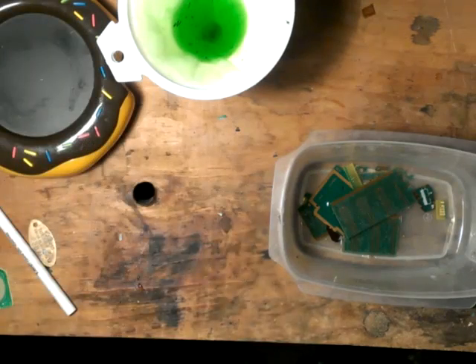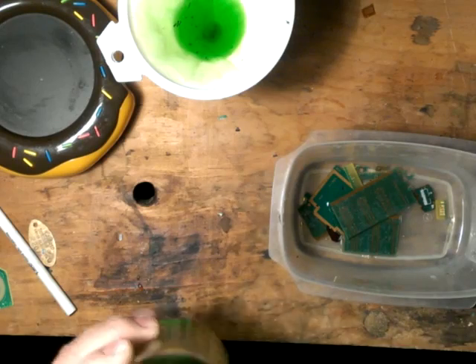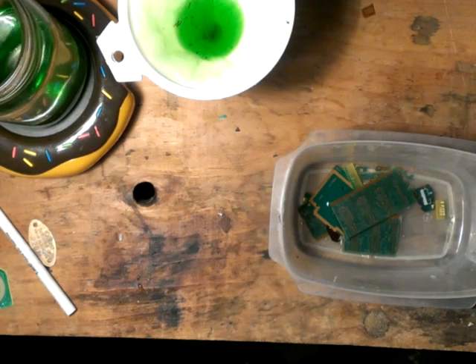Do not discard any of your chemicals. All that green stuff is copper. That can be retrieved as well. I'll do another video on that — on getting copper out of the acid peroxide solution. Right now I'm just doing the gold.